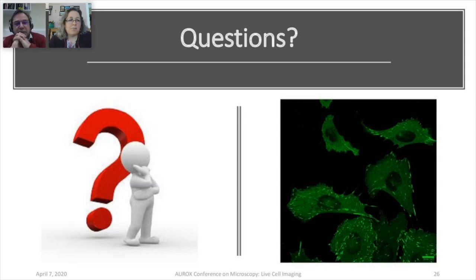So I think originally I would have definitely been of the latter, and I think that was why we started these experiments, because I was sure that lower light over a longer period of time was much better for the sample, and we wanted to provide the data to show that was the case. I think the example I always think about is getting a sunburn. If you're out in the sun for 10 minutes in the middle of the day, you get a sunburn, but if you're out around dusk, you can stay out for hours and you don't.